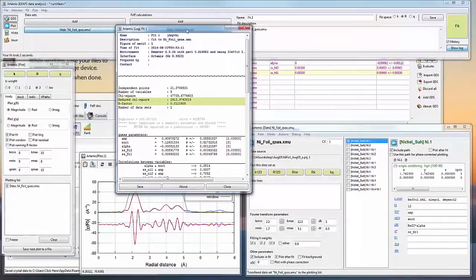And just looking at this R factor, it's pretty good compared to our other fit. Our amplitude is fine, 0.9. The error is fine. The E naught is big, just like it was in the other fit, and we can fix that. I'm not going to show how to do that now. The alpha term is only saying to change each R effective basically by 0.0008, so almost nothing.